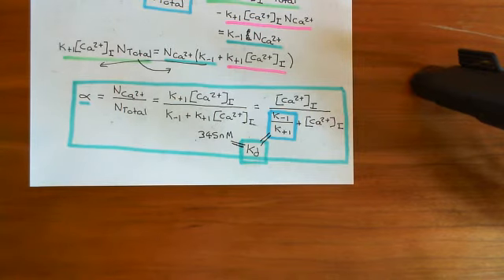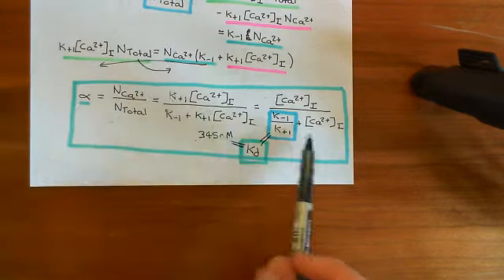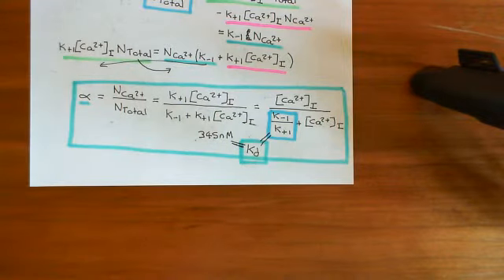I, for one, find that pretty incredible: it doesn't matter how many Fluo-4 molecules you've actually loaded into the cell. Whatever number you've loaded, the fraction of them that will end up with calcium bound doesn't really vary that much unless you take the Fluo-4 concentration to extremes, which you never would.